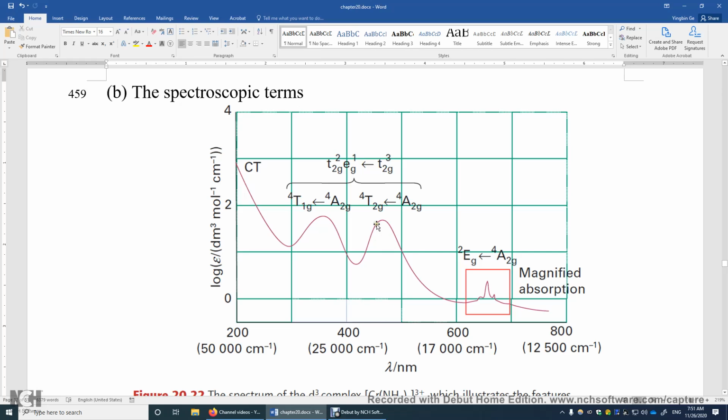The average is roughly delta O. Delta O is, I think, roughly 25K wave numbers. And the difference between this 28,500 and this 21,500 is 7,000 wave numbers, which corresponds to the difference in electron-electron repulsion due to the difference in their spatial distribution.